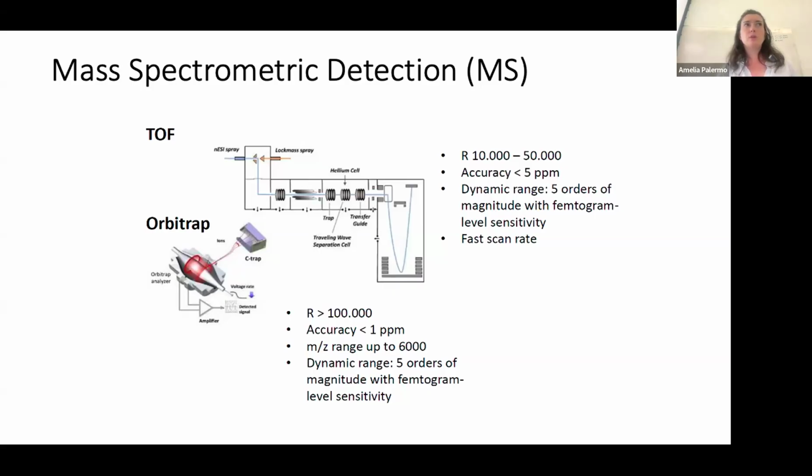Well, we would have to look into your specific setup a bit better. From how you described it, my sense is it can be at the level of selecting the mass range that you focus on, because lipids are in a higher mass range. Proteins, depending on how many charges they acquire, can fall lower than that. But small molecules are usually from 80, 100 to 1000, or 700 even. So above 700 is usually more lipids. So it really depends on the setting on your mass spec. But it can also depend on the type of chromatography; you said you don't have chromatography.